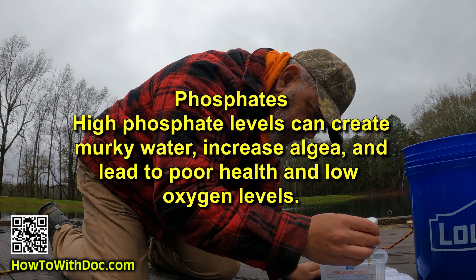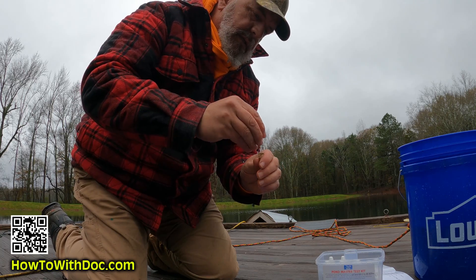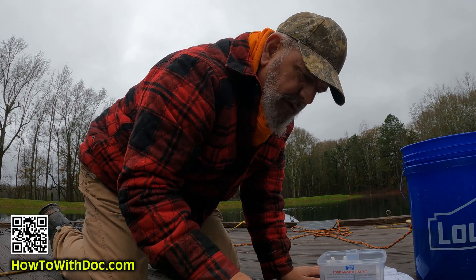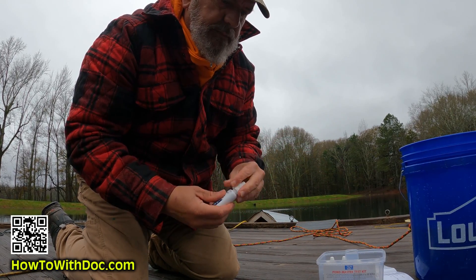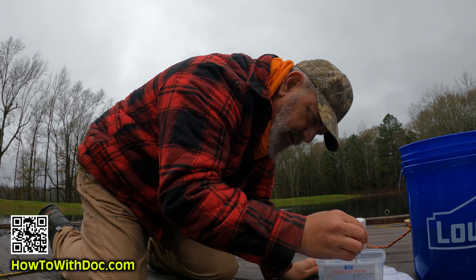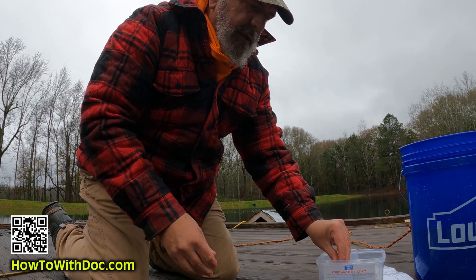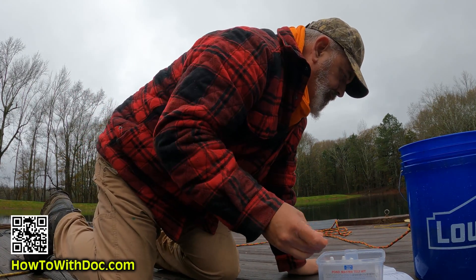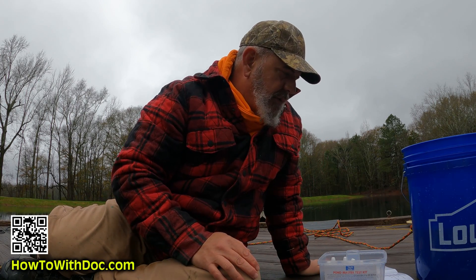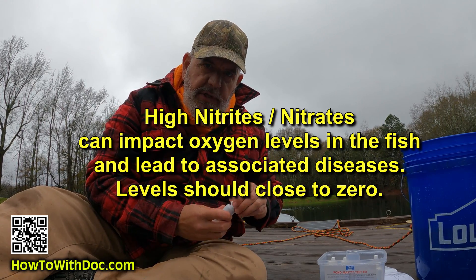For the phosphate test, I add six drops of bottle number one, cap it and shake. Then I add six drops of bottle number two — the thicker solution, which you have to squeeze hard to get it to come out. Cap it and shake again. This needs to sit for about three minutes, then I'll do the chart comparison.